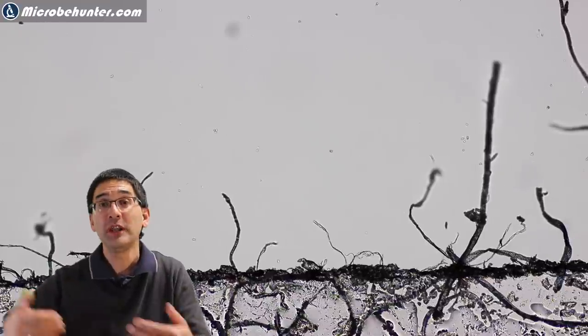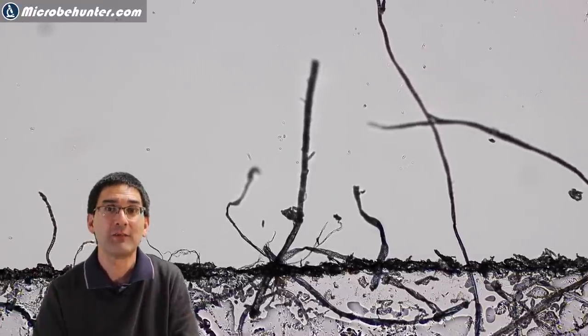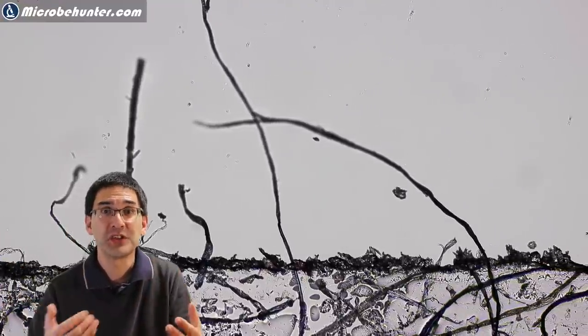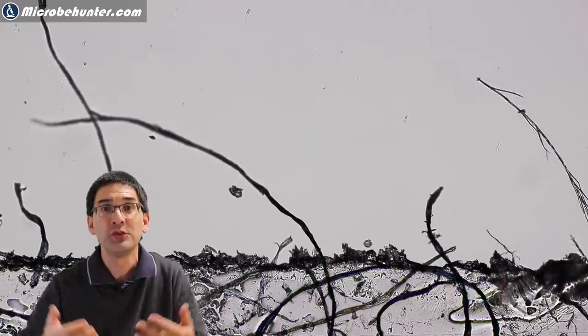And the reason is because of course white fibers on a white background cannot be very easily seen. So most of those textile fibers that you see are visible because they have a good contrast to the background.